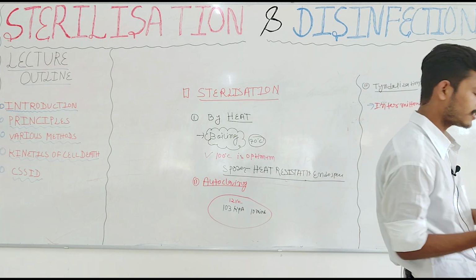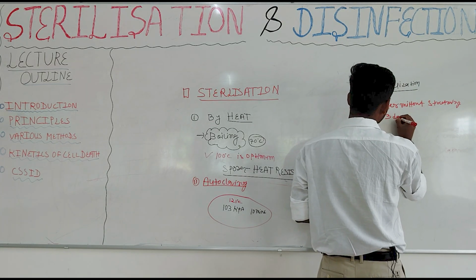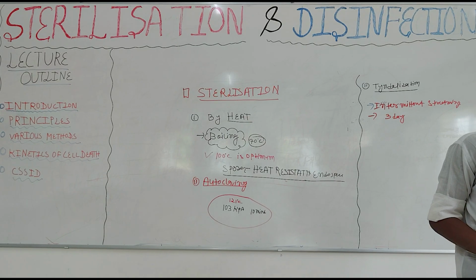And this procedure goes on for 3 days, okay? You have to provide the 3 days. That's why it is called intermittent.